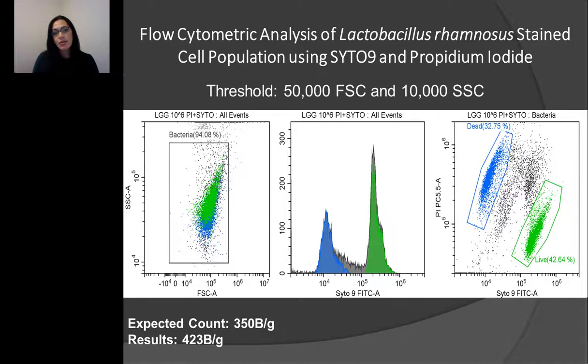That means that they are metabolically active. And the flow cytometer is able to give us those cell counts, which we cannot get with a plate. This is one of our favorite things when we get these numbers, because it shows more accuracy compared to the traditional method.